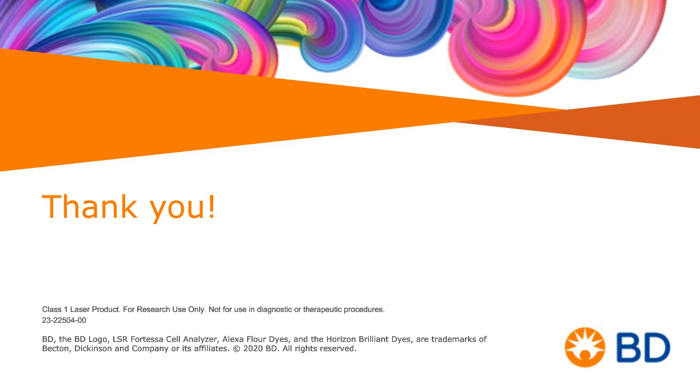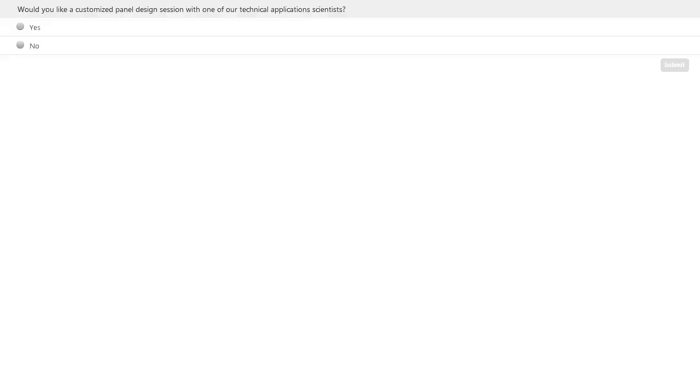The advancements that Yongchen had done with the instrument that's in Beckman Coulter today with the cytometry technology had a significant impact on how we look at flow, even in the conventional space. And as we've transitioned over and seen even new spectral instruments, it's great to see.